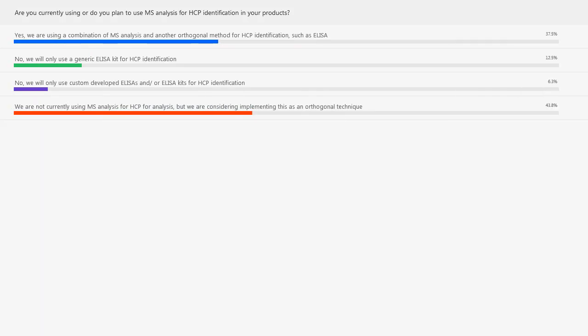Okay, interesting. So 37.5% of you voted for yes, we are using a combination of MS analysis and another orthogonal method for HCP identification such as ELISA. 12.5% voted for no, we will only use a generic ELISA kit for HCP identification. 6.3% voted for no, we will only use custom-developed ELISAs and or ELISA kits for HCP identification.